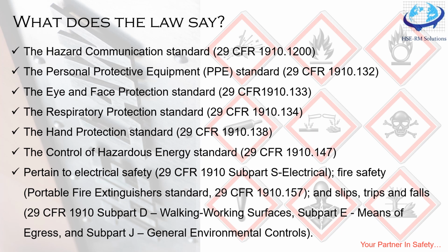Now coming to PPEs, or personal protective equipment. Each area and chemical has specific demand of PPE. There is nothing like standard PPEs. Mostly people ignore or do risky behavior because the PPE we provide is not well communicated to individuals. Day one, what is informed or instructed, the same will be followed. So when it comes to PPE, along with the material to be handled, PPE is to be defined and placed. So whenever you want to handle the chemical, by default, PPE is there.